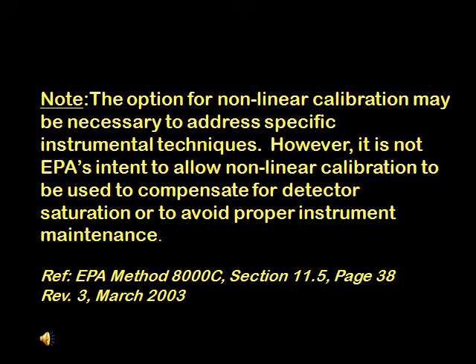What does this really mean to an analyst? Is it inappropriate to use nonlinear curves or to ever switch a calibration model for an analyte? The answer to both of these questions is no. Does this only apply to hazardous waste? While this note only applies to SW846 8000 methods, the effect that is being talked about by the EPA would be observed also in drinking water, wastewater, and air analyses, mainly with organic analytes.